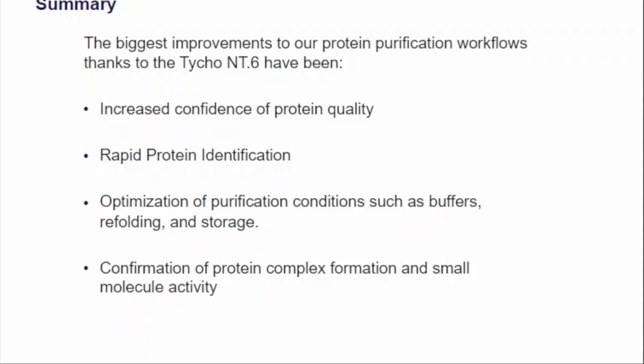And it's been invaluable for optimizing some conditions such as buffers, protein refolding, long-term storage and freeze-thaw cycling, as I mentioned, and of course, analyzing the conformation of the protein complexes or the activity of those small molecules, as I said.